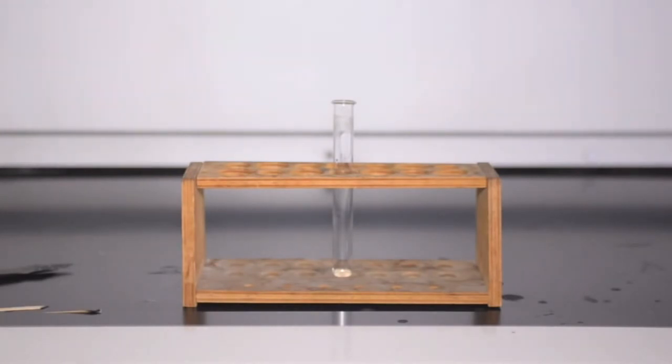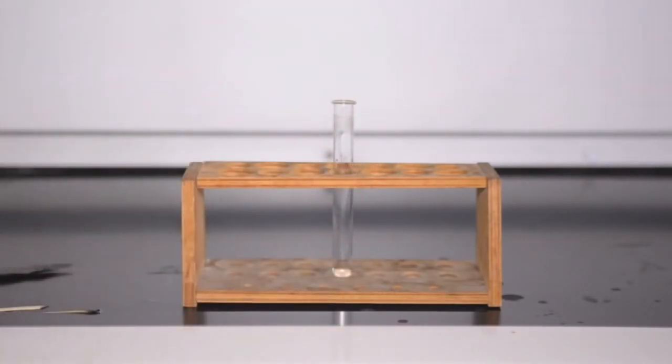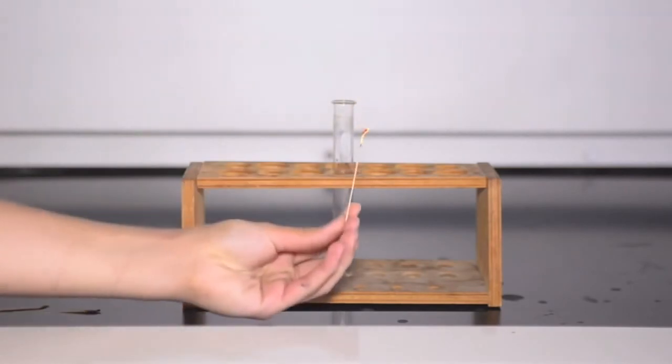By simply lighting the splint on fire, you've created a burning splint. If you blow out the fire, you'll notice that the splint glows red, and that is a glowing splint.